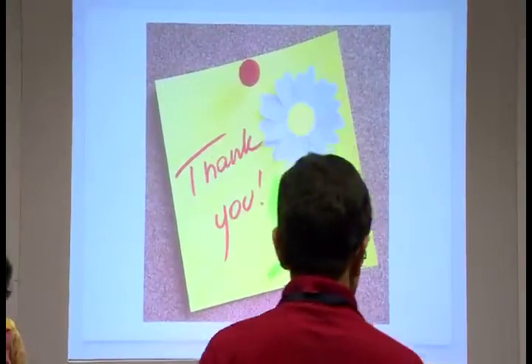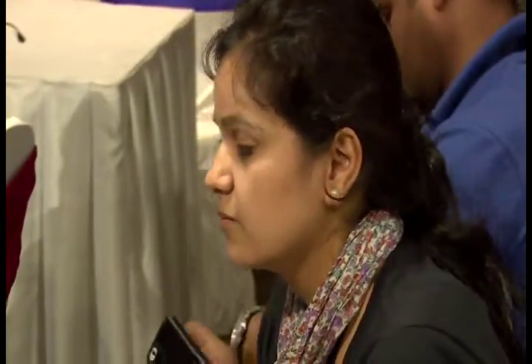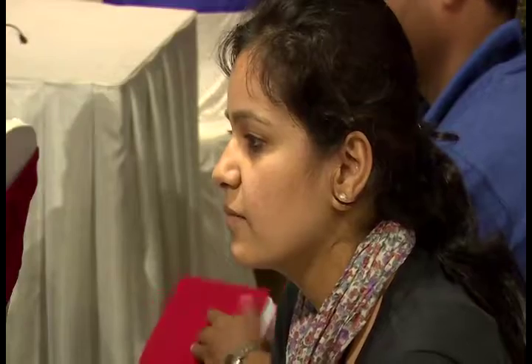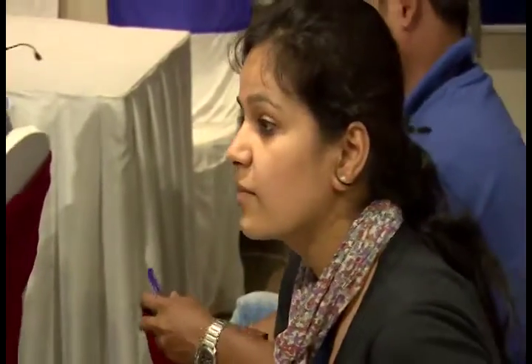Thank you, ma'am, for the nice talk. I just have one question. Is cross-correlation the only way to test the fitness of the fitting, or are there some other ways to validate? See, all these softwares do it in these different ways. This is the way they do it, but you can try. This is the easiest way actually to compare.